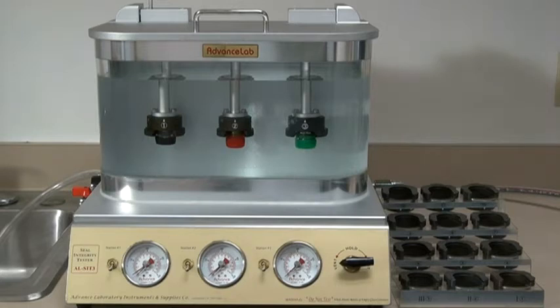A carrying basket is available so that the technician can easily transport a batch of up to 24 test samples to the testing location.